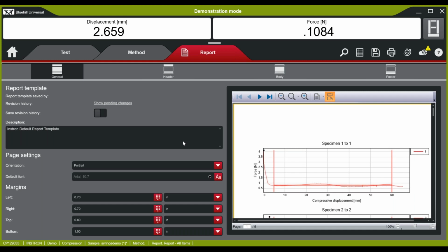And the Auto X750, which is our automatic contacting extensometer, has a biaxial attachment, so it could also measure transverse strain. So there are a lot of different options as far as extensometry are concerned to get transverse strain of a specimen.